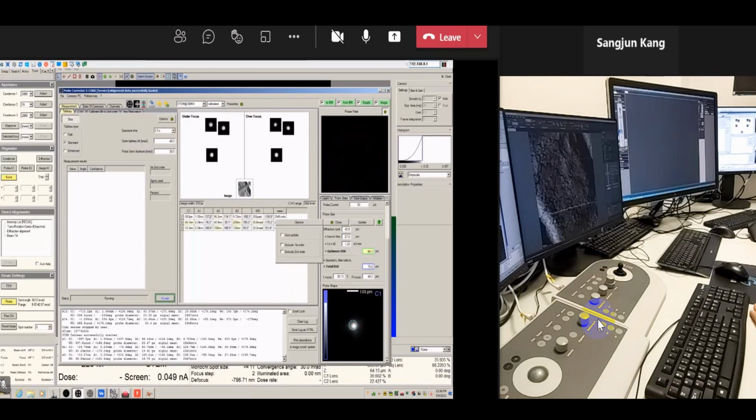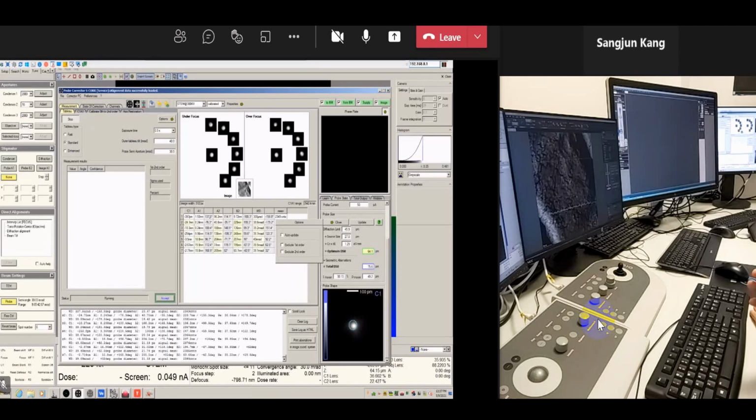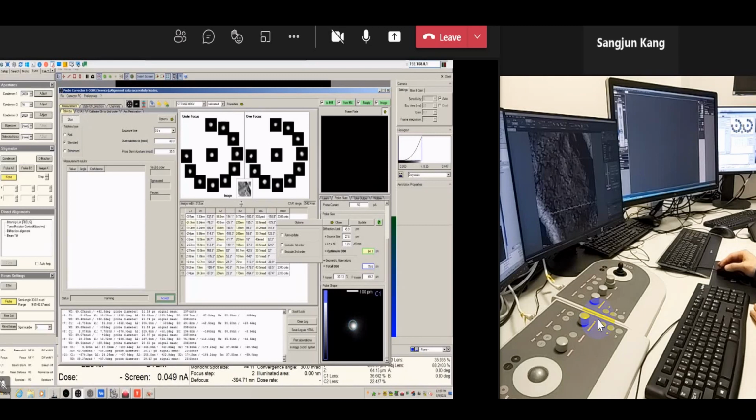I'm quite sure even if we stop here, we're going to see a very nice atomic image in the gold sample. Our sample is actually gold nanoparticles, so we will probably see many lattices because we do not have a specific zone axis of the sample.